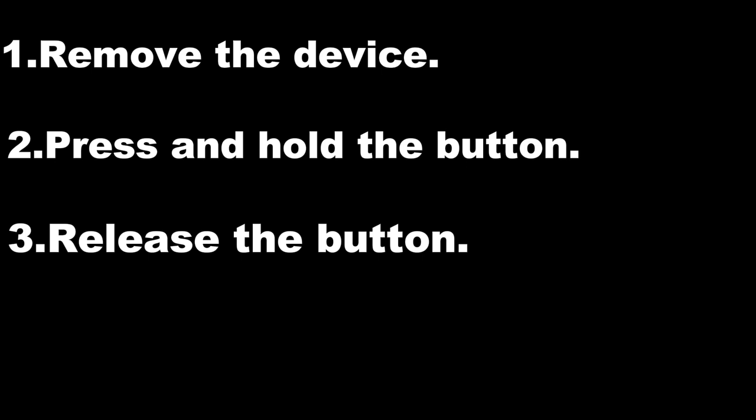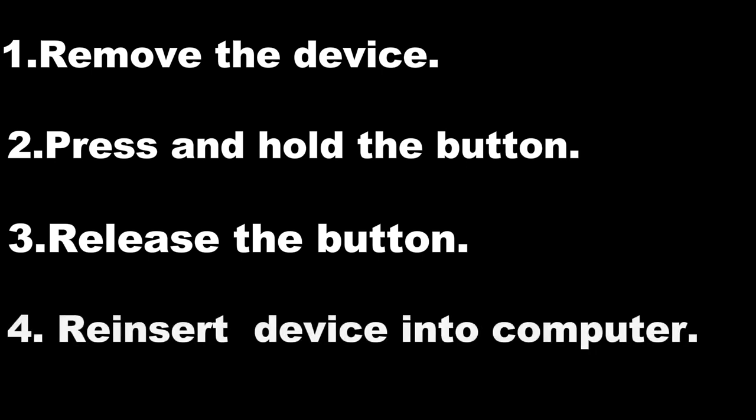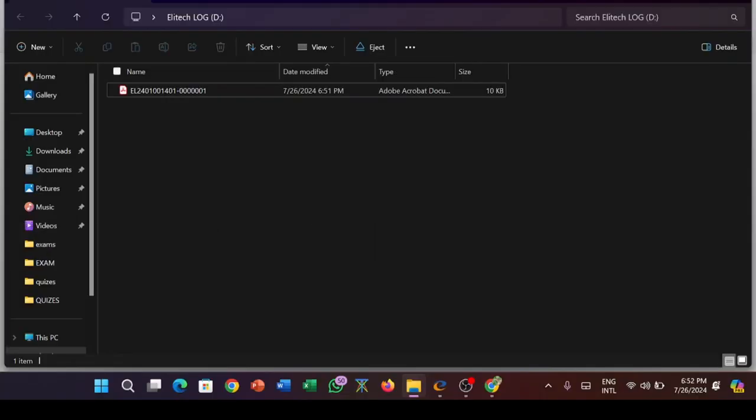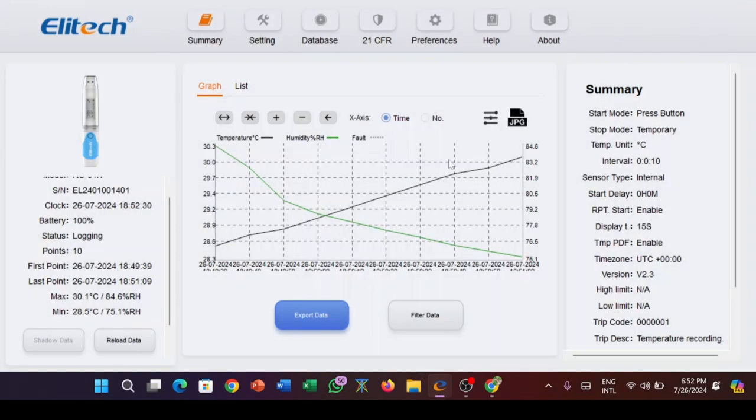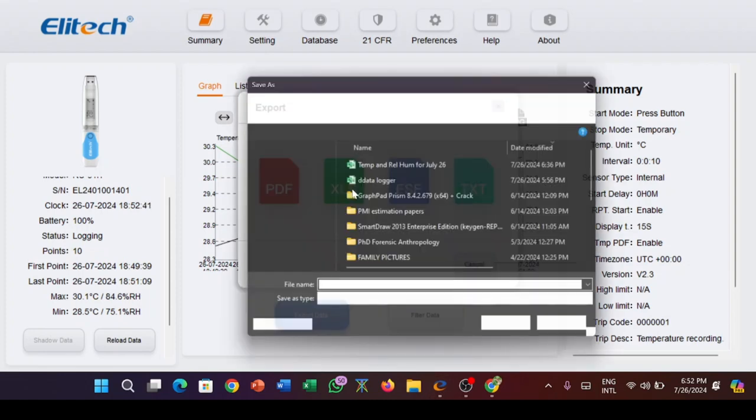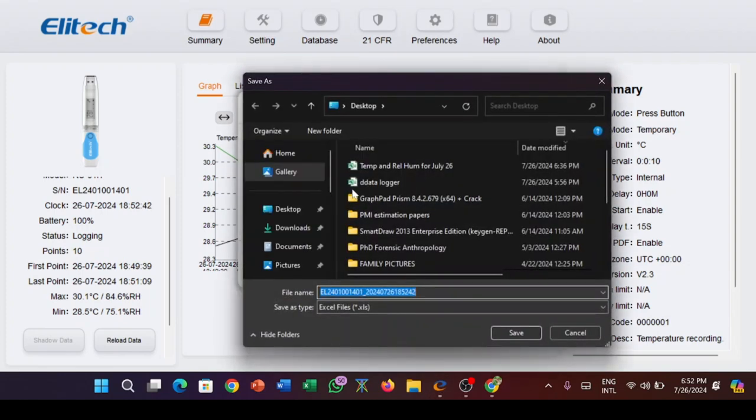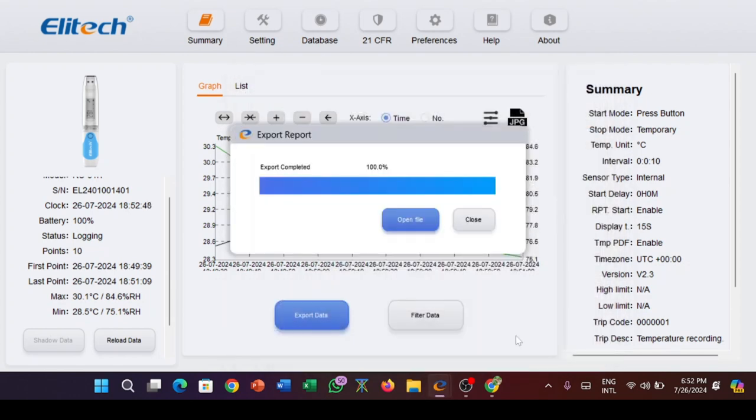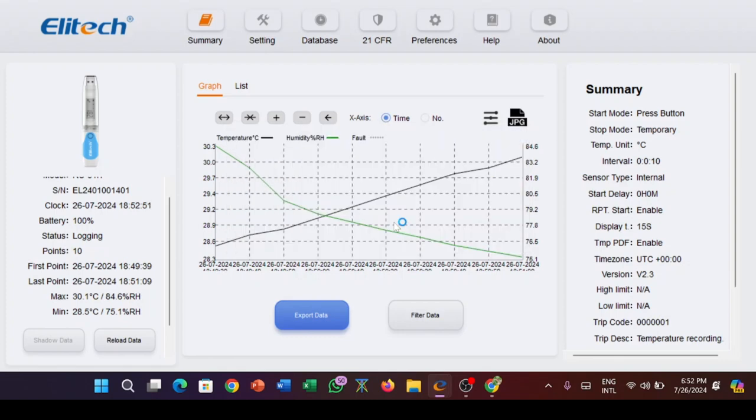To read the results, reinsert the device into the USB port of your computer. Open the Elitech software and export the data to either PDF, Excel, text format, or ESF. The Excel format is more preferable as it gives one more edits.